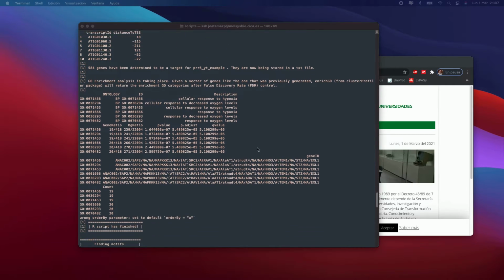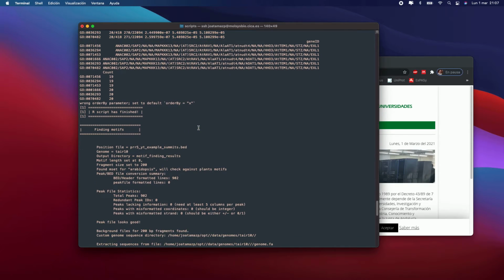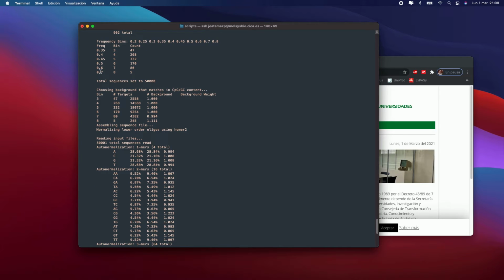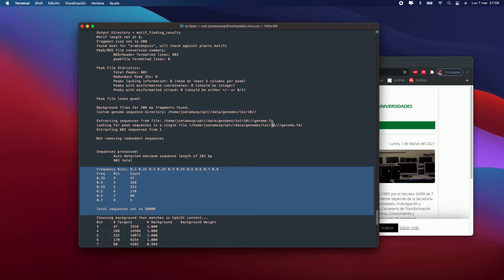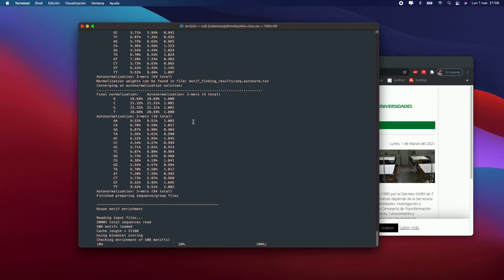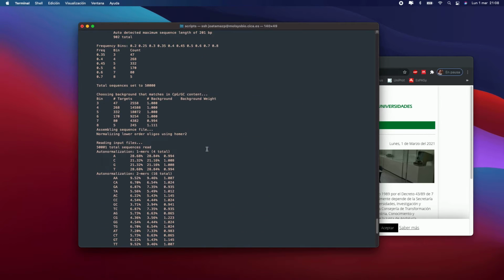Afterwards, you will have this gene ontology enrichment analysis, and the Homer analysis is taking place. It will set a few background sequences from the TAIR10 genome that it has stored. It is important to install it, but if you have previously used Homer, there might be no issues.